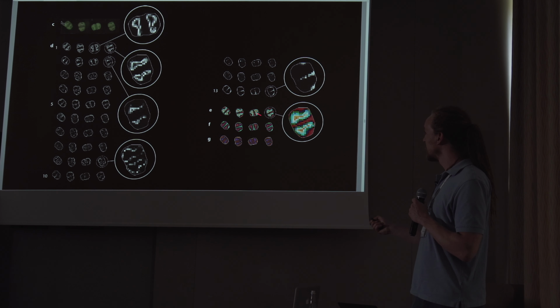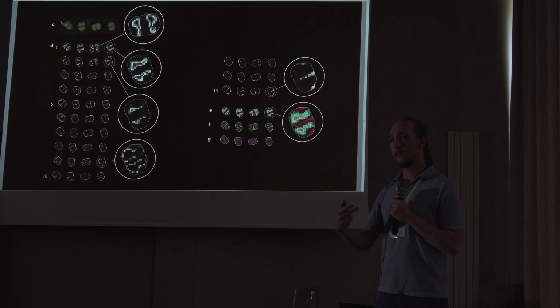Down here you see a summarization using t-SNE. Here is a summarization using UMAP. And here is a hierarchical clustering of this activity map matrix.